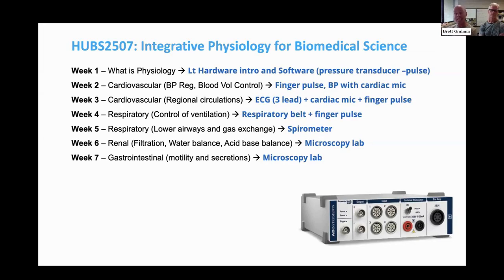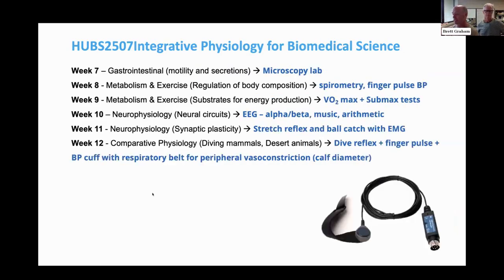So there, again, that's LT based though. So Phil, who's the course coordinator, has embedded everything within LT. So they're still using the microscopy lab, taking a photo, then uploading it into LT and annotating where cells are and comparing and cross-referencing with some material that's also in there.